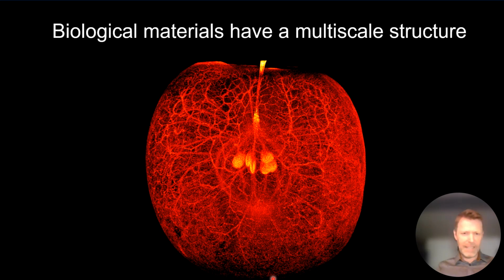Now, what we particularly see in this image is the fascinating structure of the vasculature tissue that extends throughout the whole apple and can take lengths up to 20 meters in total in a single apple only. Now, this is a very important structure to the apple as it is the pathway to supply the water, the nutrients and the sugars into the apple while it is growing on the tree.